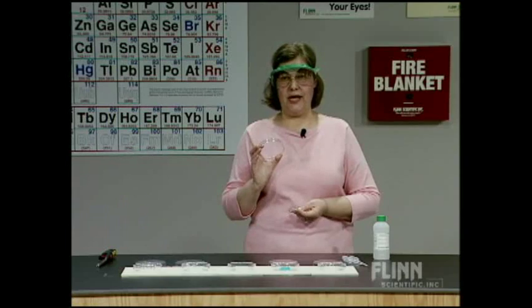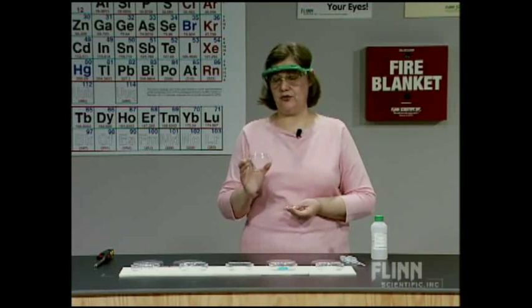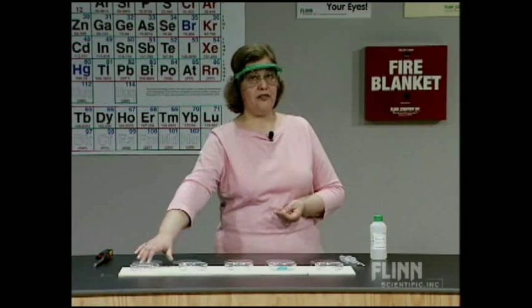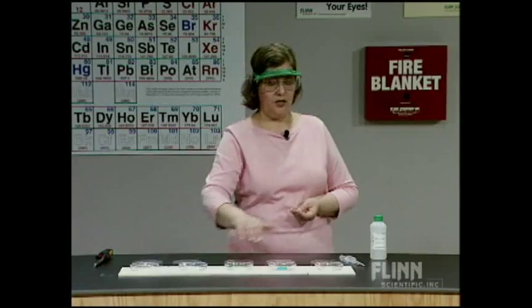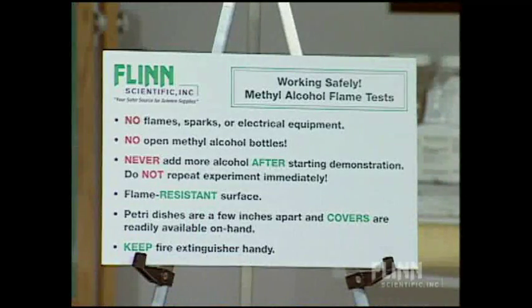Do not use watch glasses - you can't tell if a watch glass is borosilicate glass or not. Use borosilicate glass petri dishes and check them before use to make sure there are no cracks or other damage. We have a fire extinguisher right here behind us. We are ready.